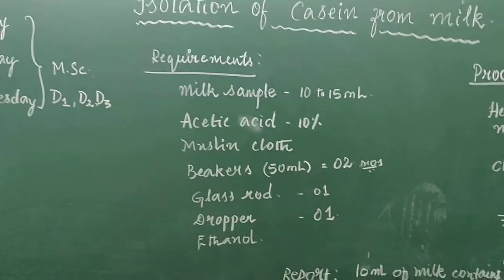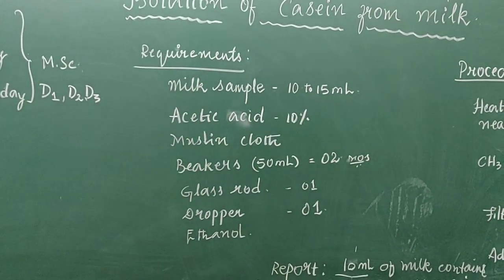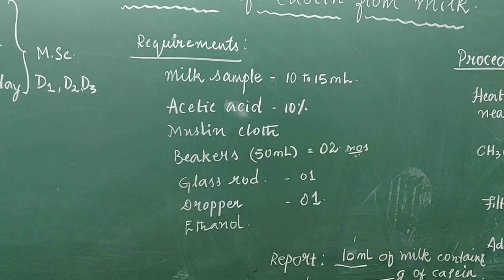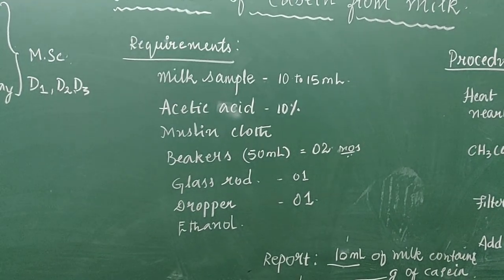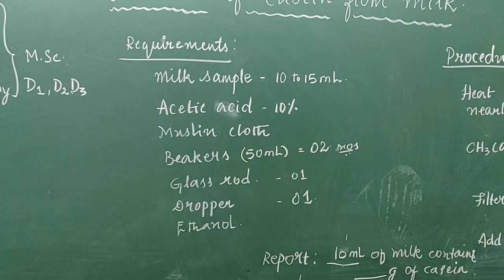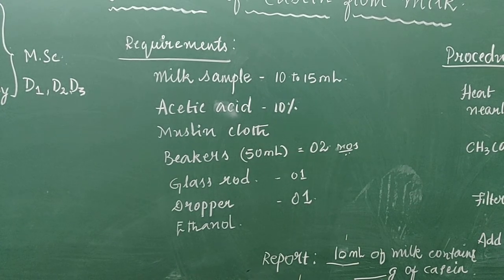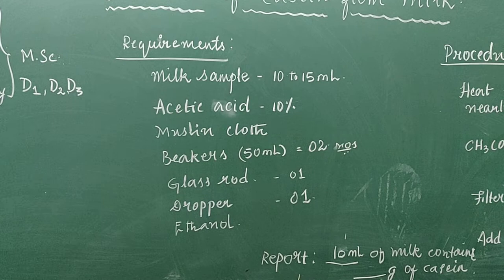The requirements for this experiment are as follows. You need milk sample, any milk sample would do. Today I am going to consider Nandini milk sample from Hassan dairy. So I shall take 10 to 15 ml of this.